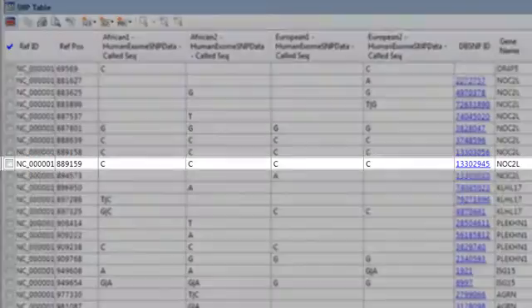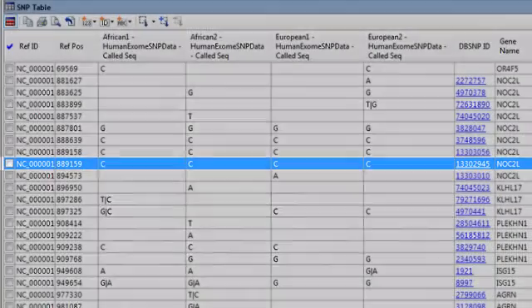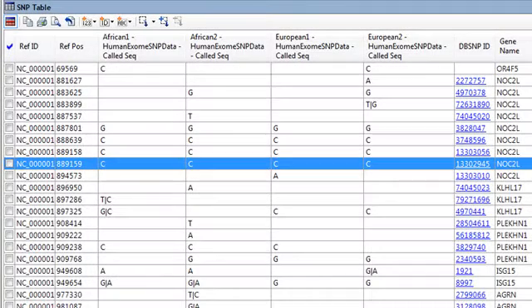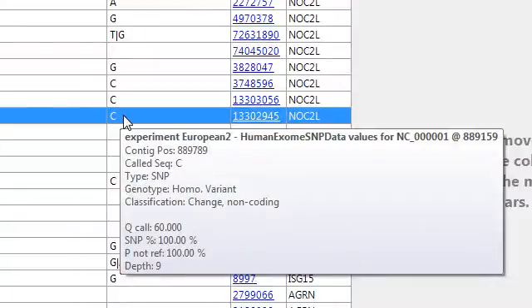So at this particular position on chromosome 1, for example, each of my four individuals showed the same SNP, and if I hover over any of these values, I can see more information about that SNP.